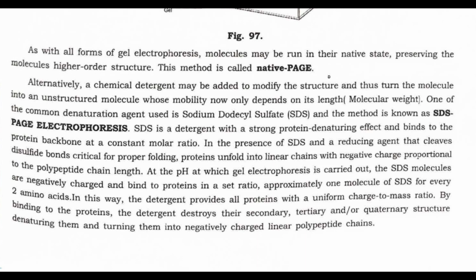One of the common denaturation agents used is sodium dodecyl sulfate, SDS, and the method is known as SDS PAGE electrophoresis.